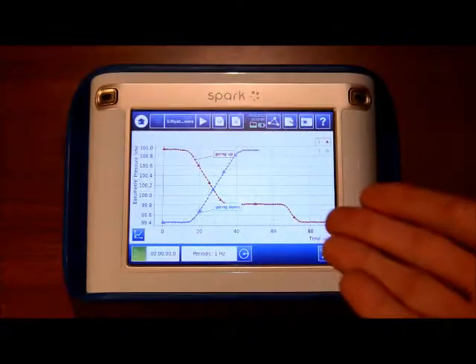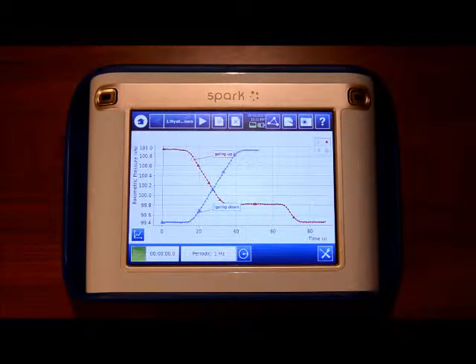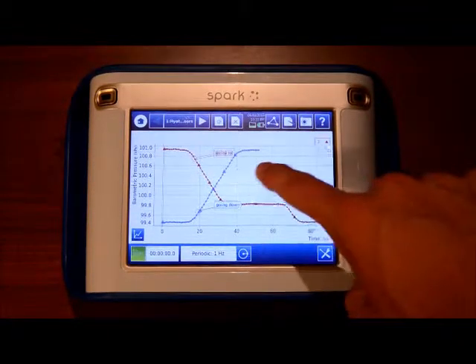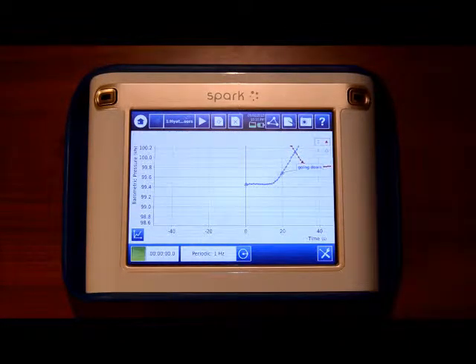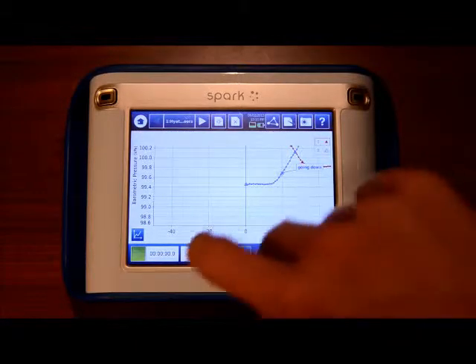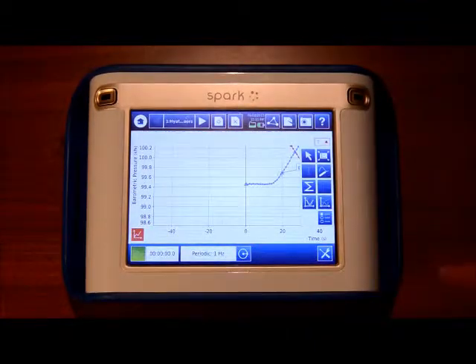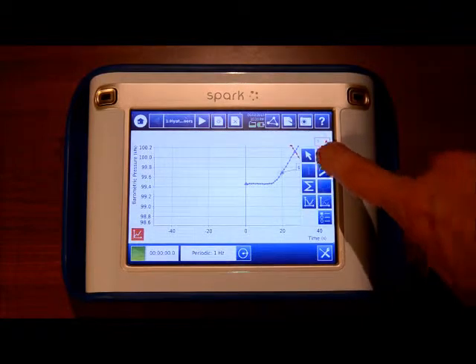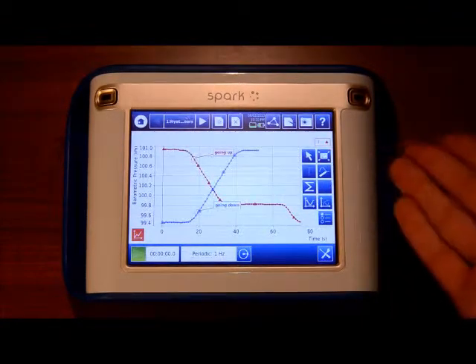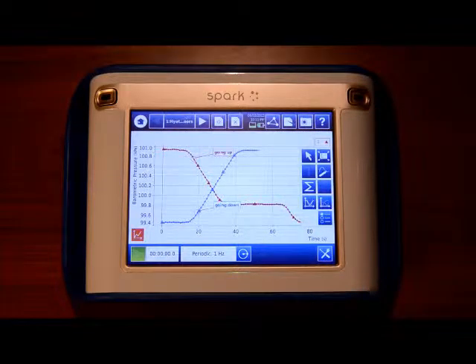Let's say you have this set of data, but let's also say that it's a bit difficult to read either because of the way it's scaled or the way the information is placed, such as if the graph looks like this. Now, what you will want to do to find the fit of data that makes the most sense to your specific set of data is to click this graph button, then click this button with the square and arrows around it. That is the best fit button, and as you can see, it has fit the graph to where the data is easiest to read.